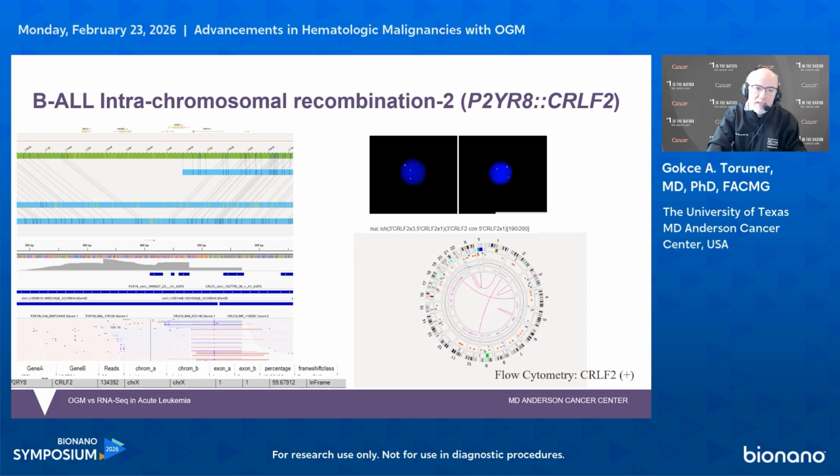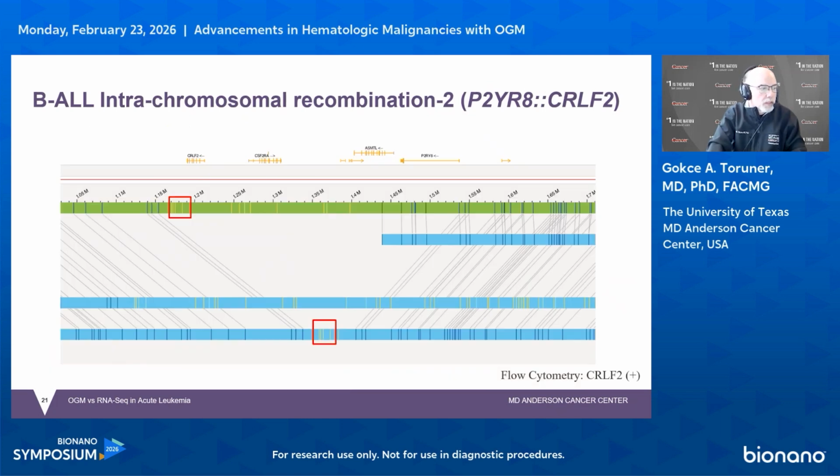So I have learned my lesson from the AFDN-KMT2A one, right? When we are looking at this, these band patterns are highly similar to this one. And I can see those blue stripes.